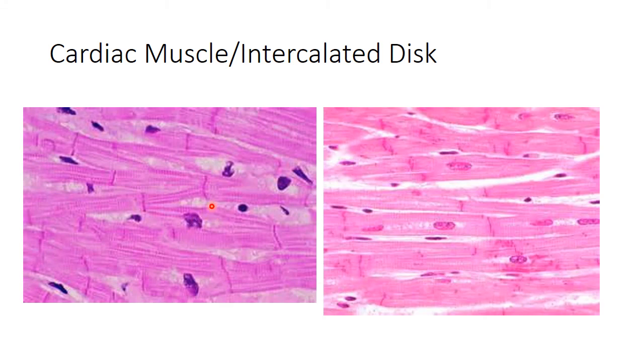As you look at this, you got the striations, the stripes going across. But see this little line going across? That's called the intercalated disc. See these lines cutting across? So don't mix those up. These are striations. The lines are the intercalated disc. What's these black things? That's the nuclei. So this is kind of a funky looking thing. They branch all over the place, don't they? But that intercalated disc allows the transfer of ions from one cardiac muscle cell to the other. So the heart beats as one smooth unit. So once again, intercalated disc, and there's the nuclei.